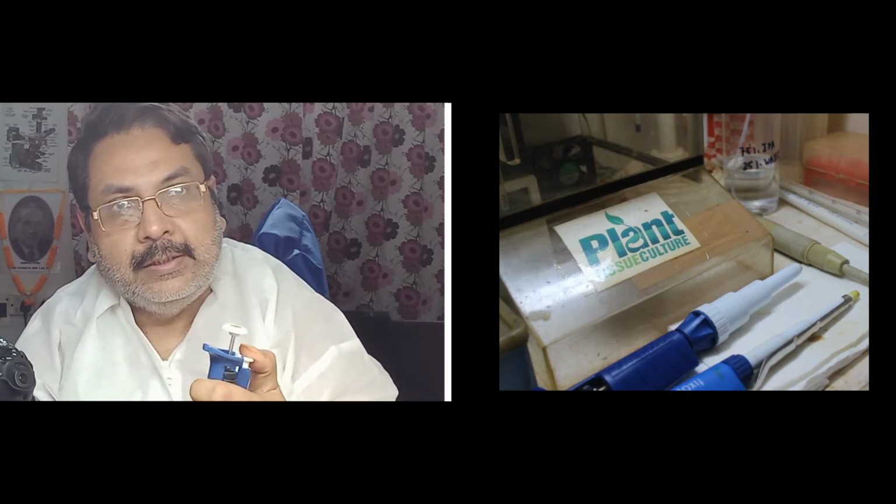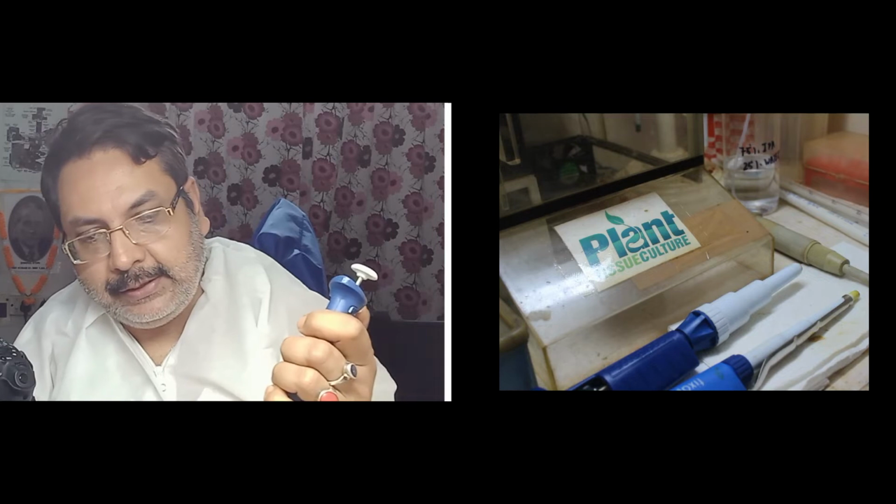air outside, and release the plunger. It will keep up the liquid. Now this plunger is to strip off the tip. As you can see, this steel bar is moving down and it is just moving out the tips. So this is the tip releasing plunger, and here you can see a dial.